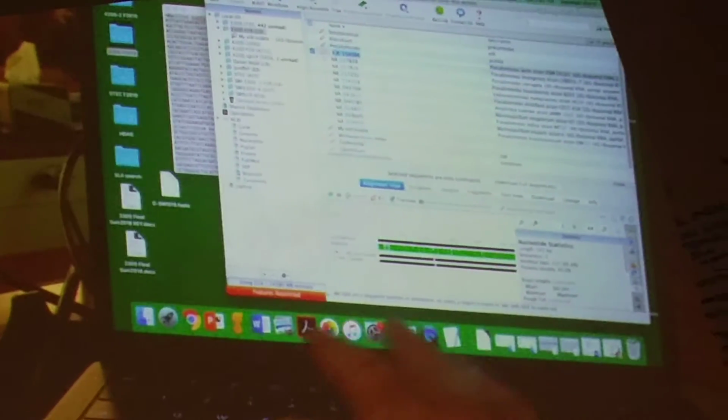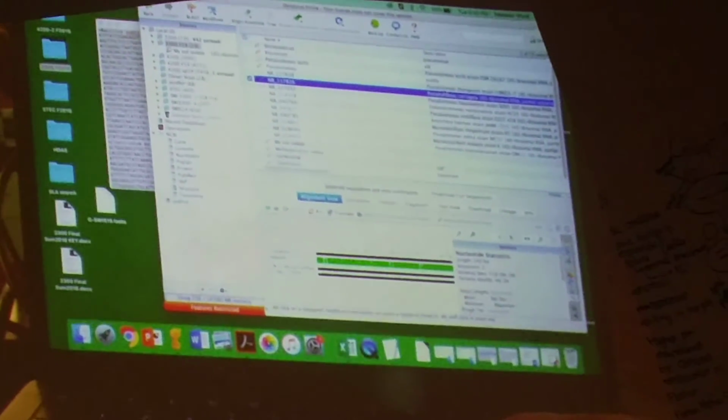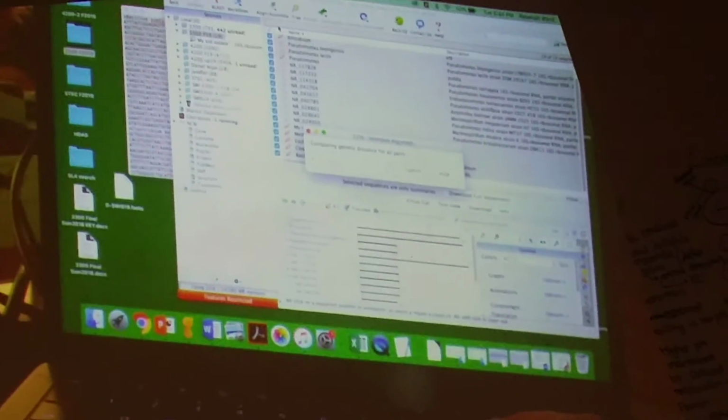That funky name is called an accession number, and if you get super into phylogenetics, you'll need to know them. But for right now, you can just copy these species names and have them replace the accession number. Once you've copied everything, I swear it is this easy: align, multiple align, go for it, use the defaults. When that's done, you'll press tree and you'll have something truly beautiful.